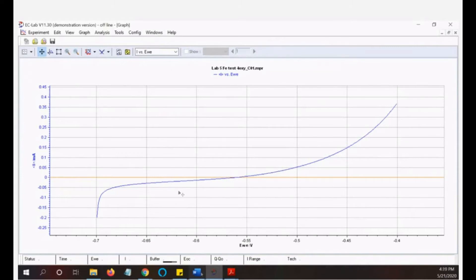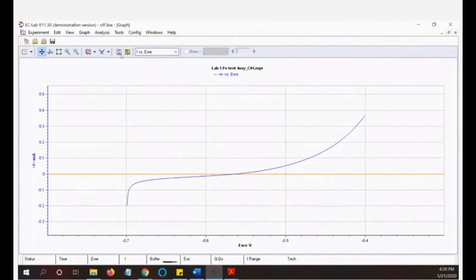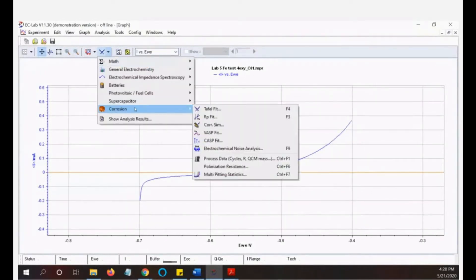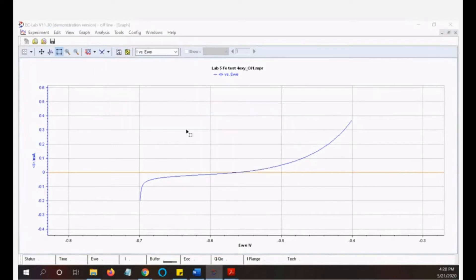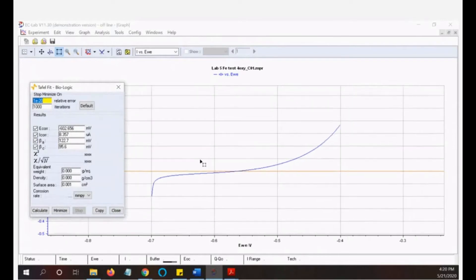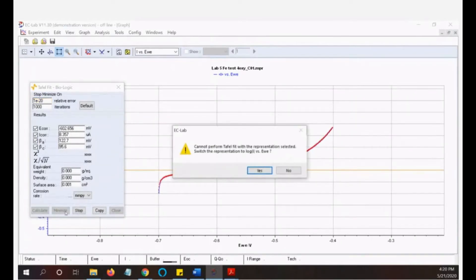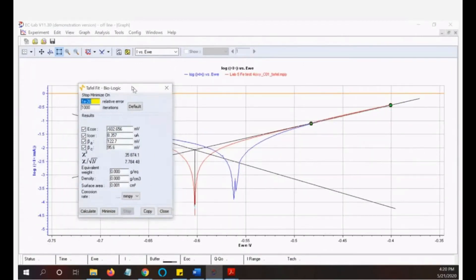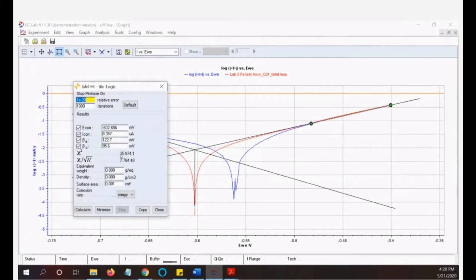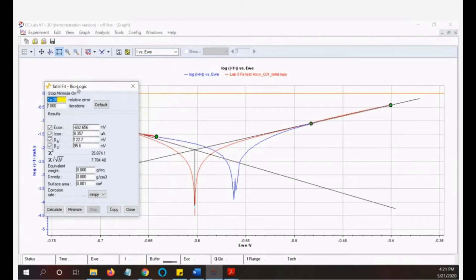Now let's see the result. This is the analysis menu for corrosion. We have Tafel and RP. I'll start with Tafel. This screen will appear — I select the data and calculate. As you can see, the graph automatically changed to log I against voltage. Previously it was voltage against I, but running the Tafel analysis automatically changed it.